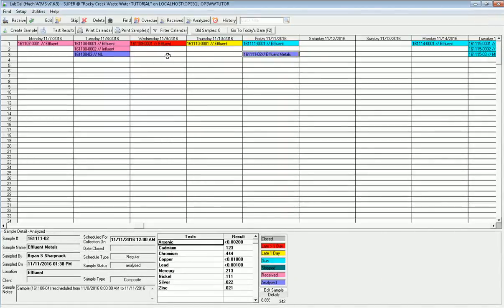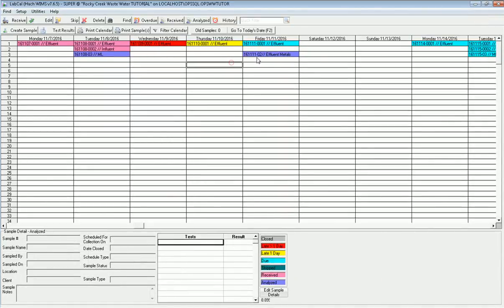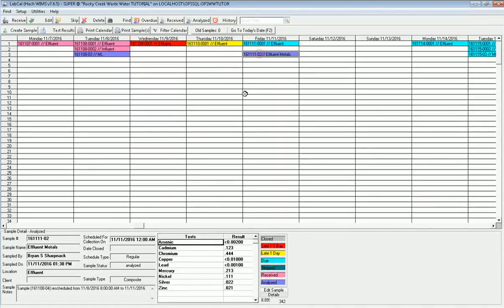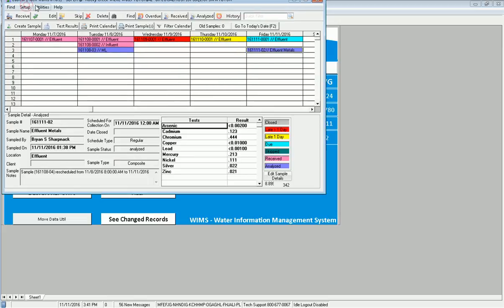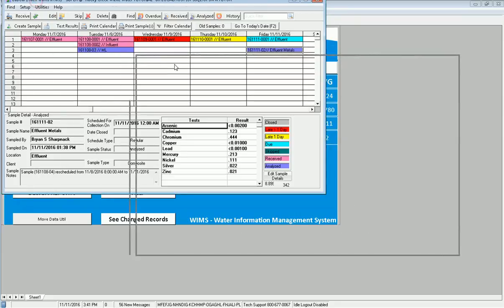Again, if I click save changes and exit, notice that that sample now becomes purple, which means it's fully analyzed. All results have been entered.